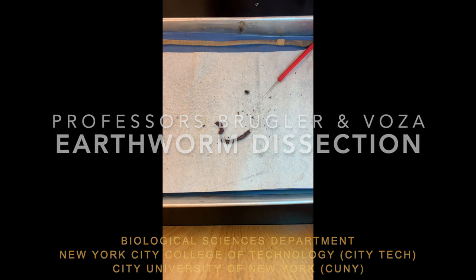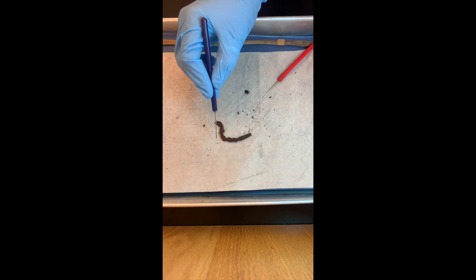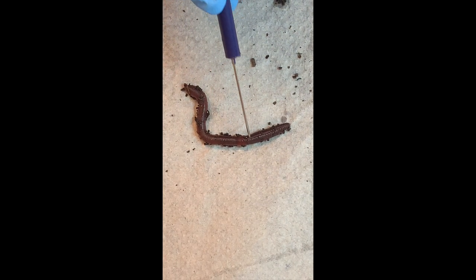What are earthworms? Earthworms are annelids, or segmented worms, and we can actually see that on a fresh worm here. They have segments — little rings that you can see, as if you put those rings together to make the worm. What do we call those rings, those segments? Somites.